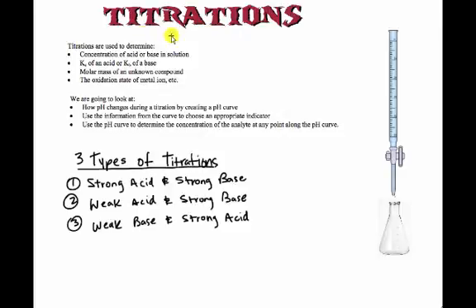Hello, today's video lesson is on titrations. We're going to look at what titrations are. I'm going to talk about how we use titrations, and I'm also going to talk about the three general types of titrations that you're going to see.